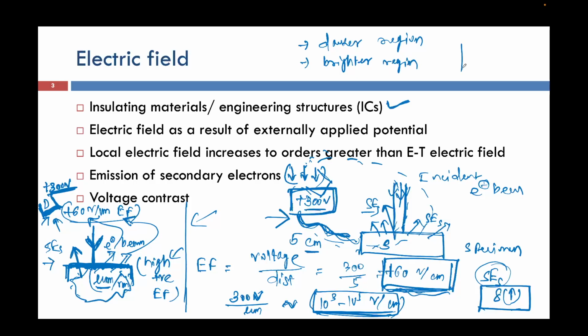So eventually what you will get is somewhat like white, black, then again black, white, then black, again white, then again black. So this kind of band structure you will ideally get, but it also depends on your microstructure. It need not necessarily be this one.